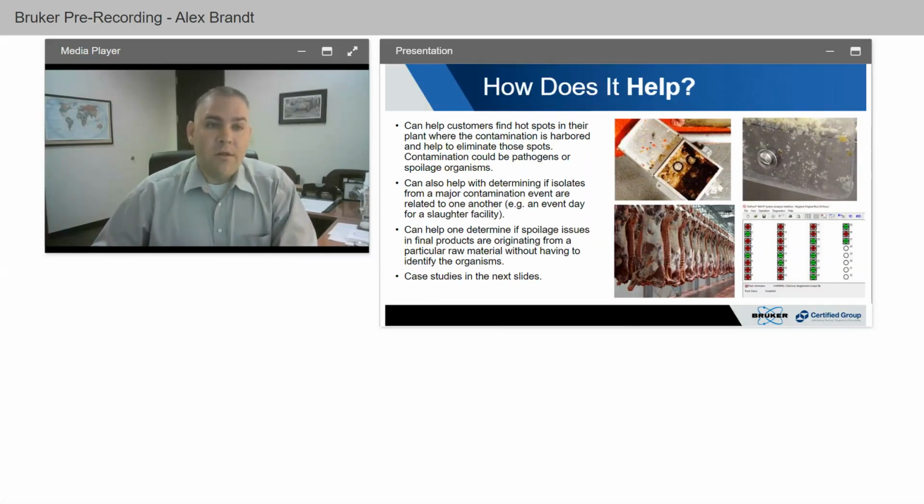So how does this help? Well, as I mentioned, once you have that information as to whether there's a source within the facility that's causing this contamination or some sort of external source, you can then go on the hunt. That's the fun thing to do with this, to go and find the hot spots in your plant where that contamination is harbored and help eliminate those spots. That could be pathogens, it could be spoilage organisms, a lot of different things.